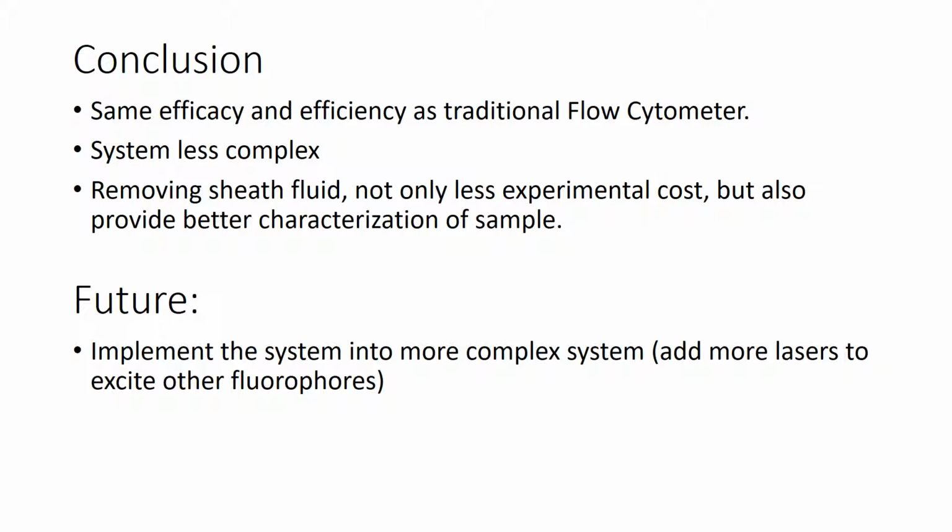Also, this system can be further implemented into a more complex system, where several lasers can be added to excite other fluorophores.